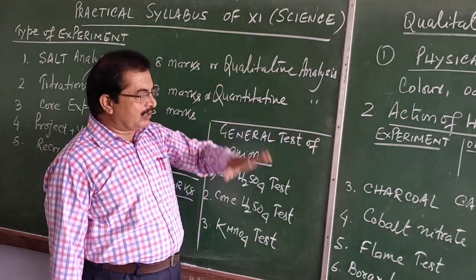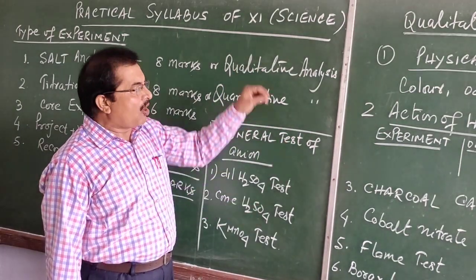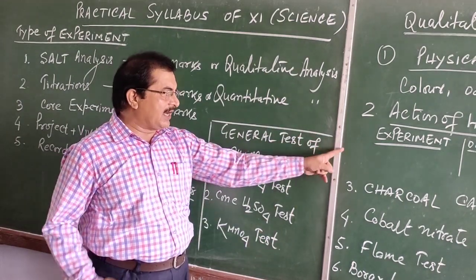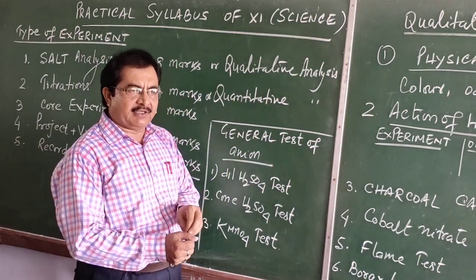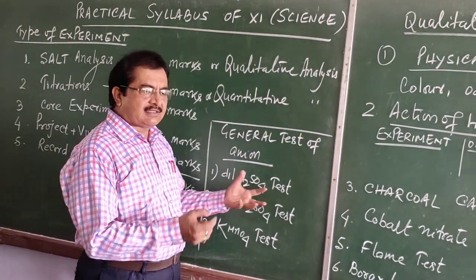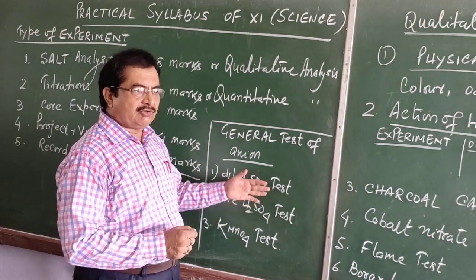So please remember this: right from the beginning, each test in chemistry, of the qualitative analysis, we write in tabular form. And when we write the experiment, we write in passive voice, not active, passive voice. That is, this salt is taken. We won't write 'take a salt'. This you should not say.